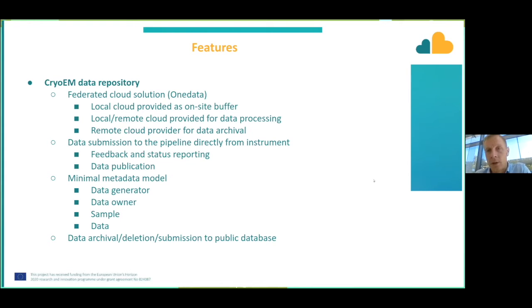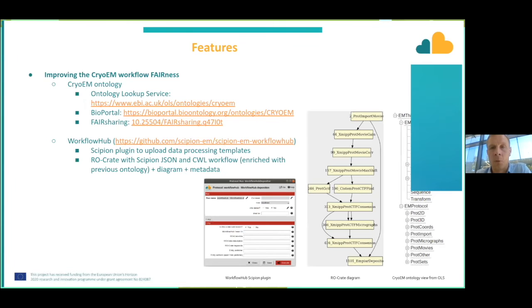One feature is that we can submit the data to this pipeline directly from the instrument and see the feedback and report on the actual status. Also, the system contains the workflow for the data publication that is contained within the data model. And again, over to Irene.